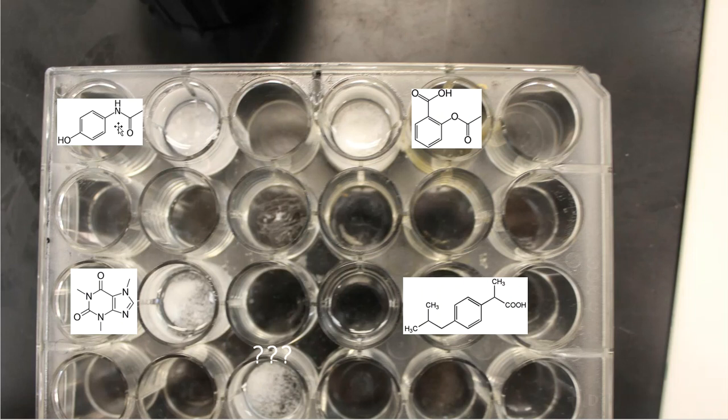Up here at the top, this is my Tylenol structure, right? And then down here, I'm going to say here's one. Here I'm going to say lane number two. This is my caffeine structure. Up here at number three, this is my aspirin structure. Four, it looks like there's nothing in it, but there is. That's ibuprofen. And then number five down here at the bottom, this is my unknown. So that's why there's question marks behind it. Okay, so here's the story at this point.